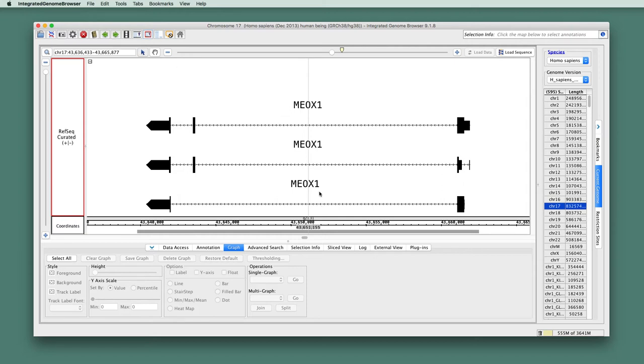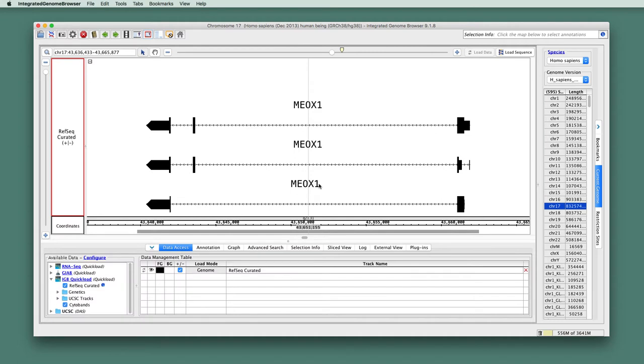So here they are. So this is MEOX1, and it has three gene models annotated to it, and they mostly differ with respect to the presence of an exon near the three prime end of the gene model.